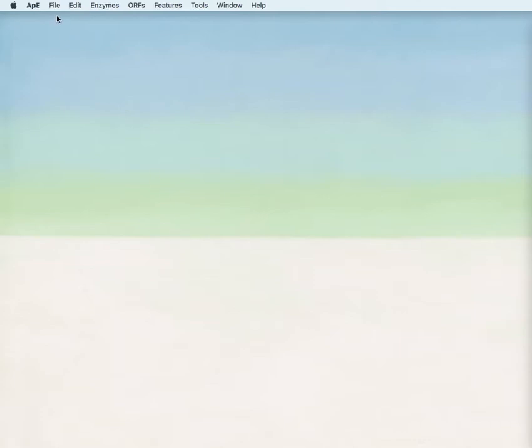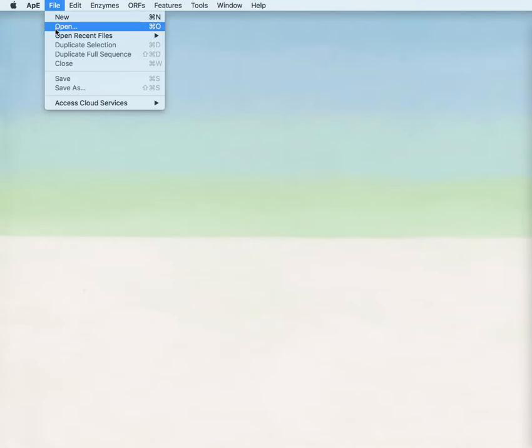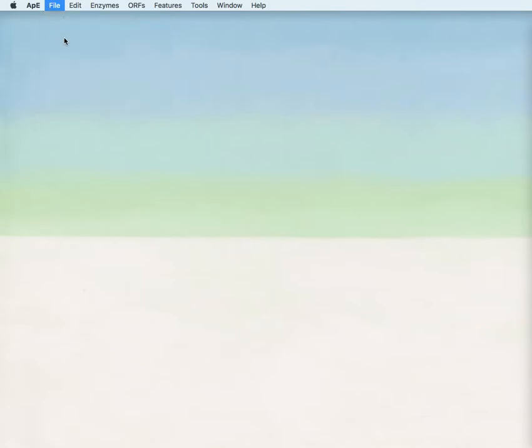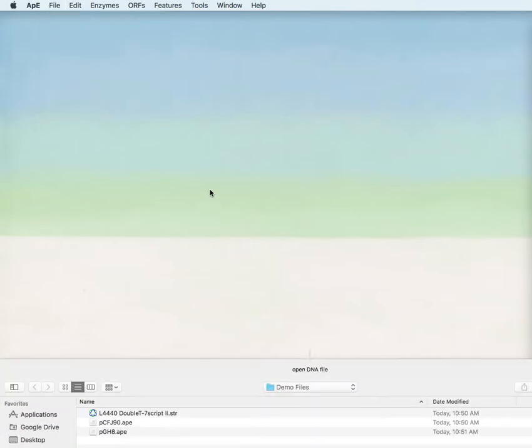Welcome to the eighth tutorial video series. This video will talk about how to work with basic sequence files. First, use the menu to open a sequence.